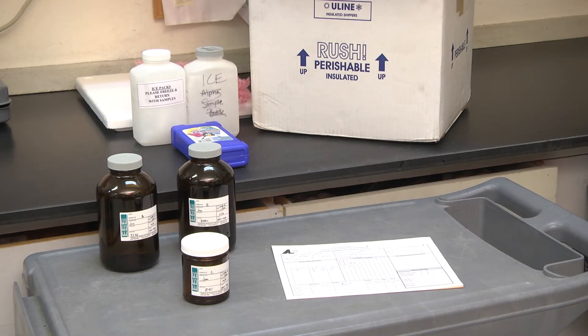When samples must be shipped to Anatec Labs, it is important that the samples be labeled and packed correctly and that the samples are packed so that they remain cool and intact throughout the shipping process.